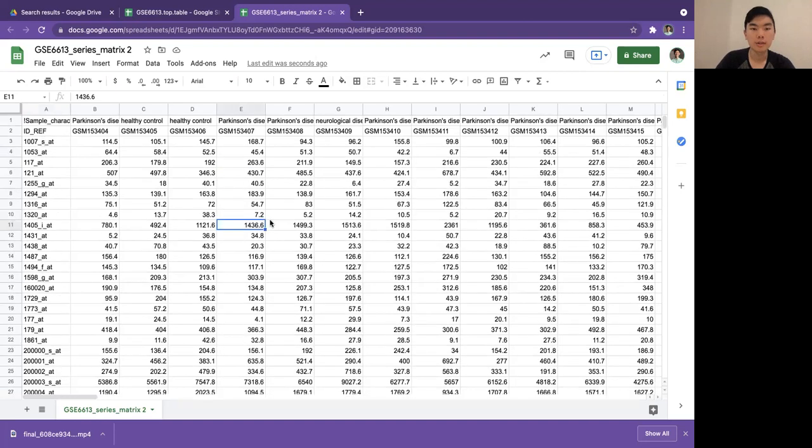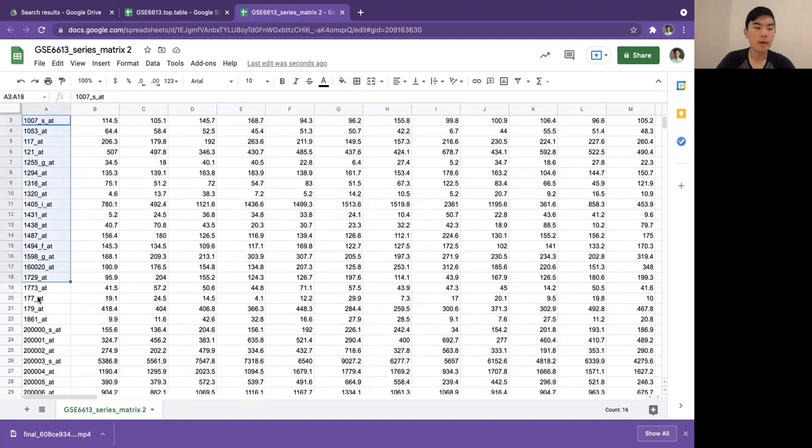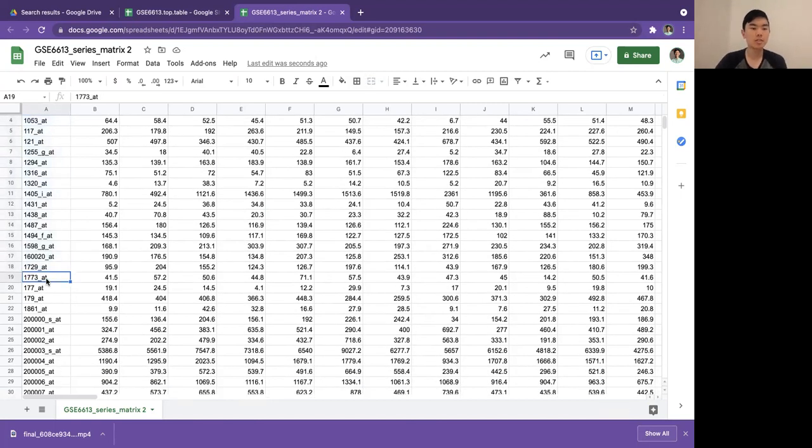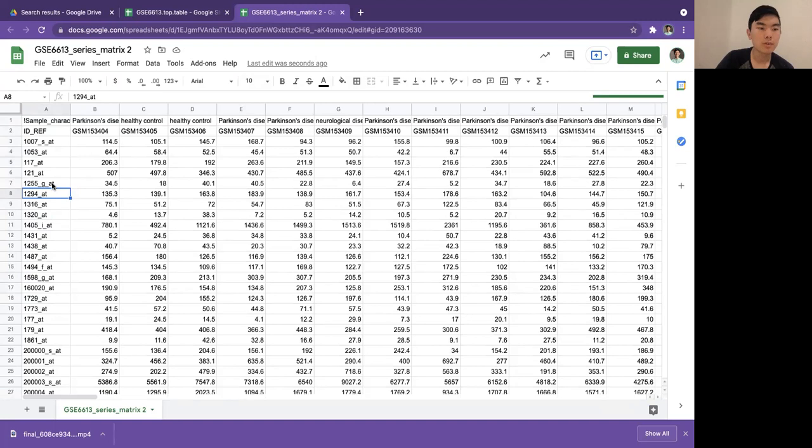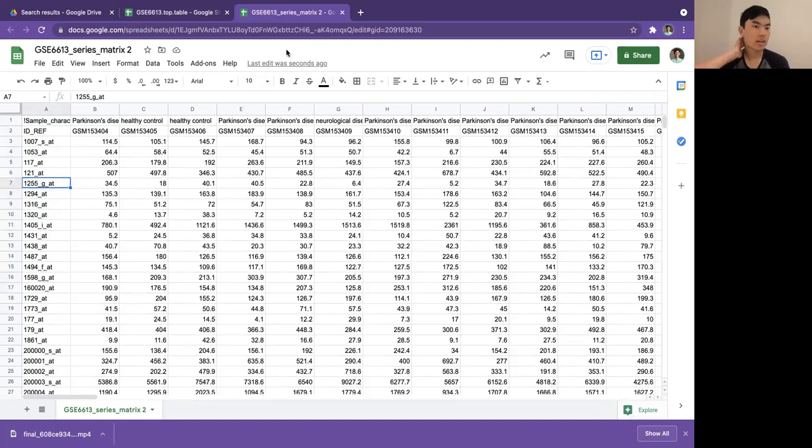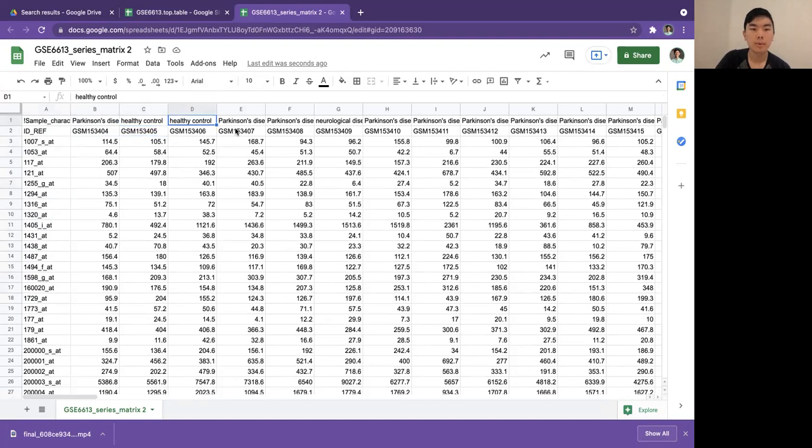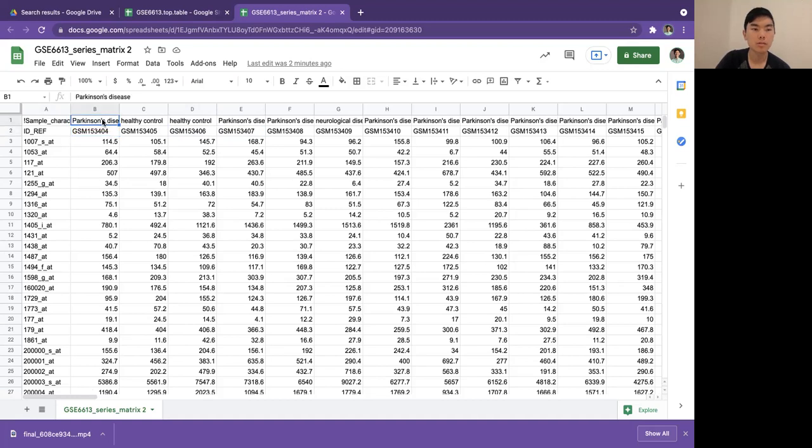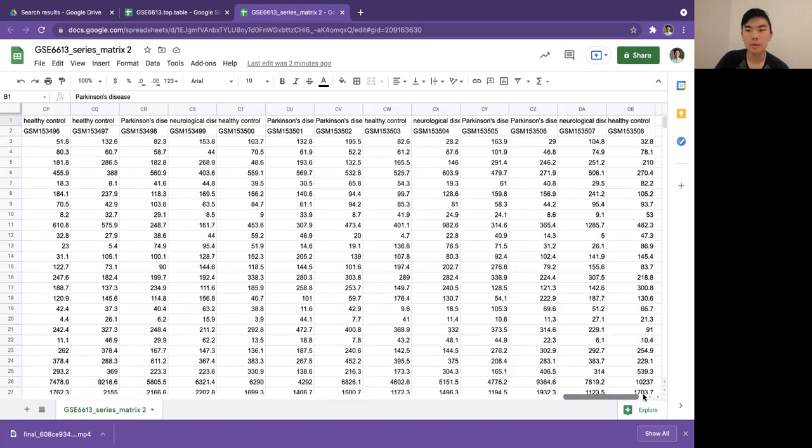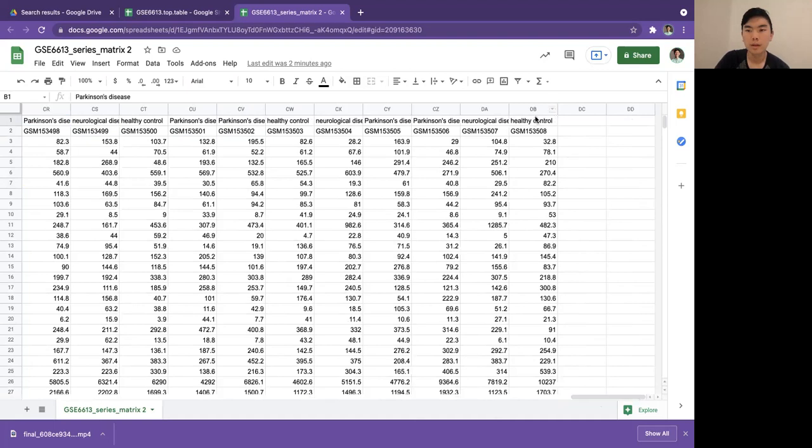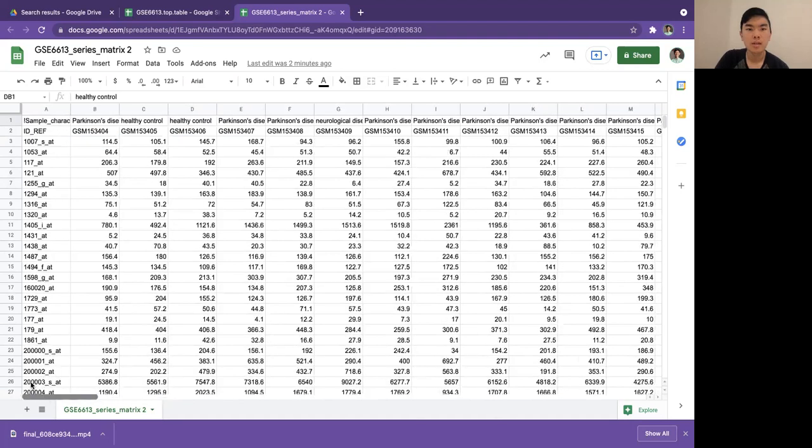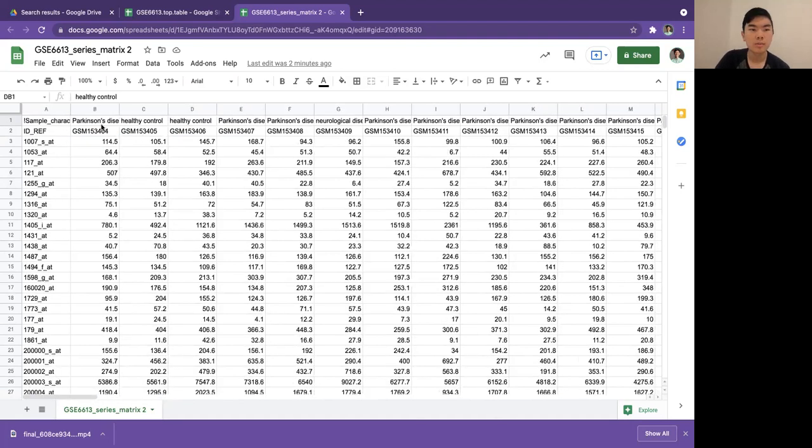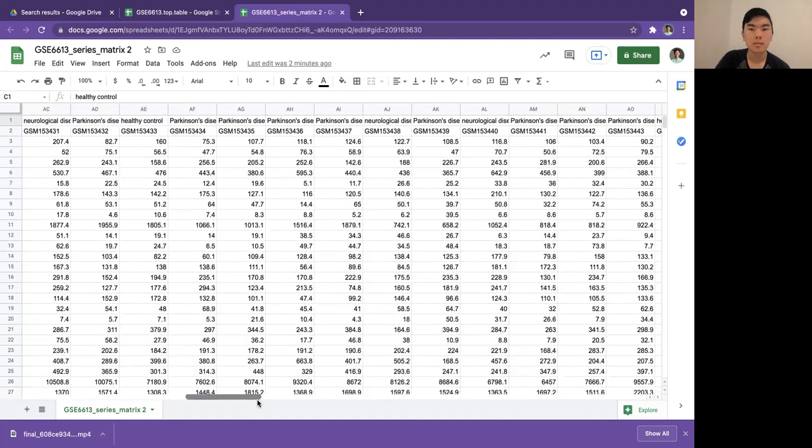I'm going to really briefly go over what this table is and how you can interpret it. On each row in column A is a different gene being probed by the microarray. These like 1294at, 1255gat, they're just the manufacturer names for the genes that each well on the microarray probes. The columns are each a patient from the data set. GSM 15304 would be a Parkinson's disease patient, and there's going to be about 100 of them in this data set in total. Some are Parkinson's disease, some are healthy controls, some are neurological disease controls.